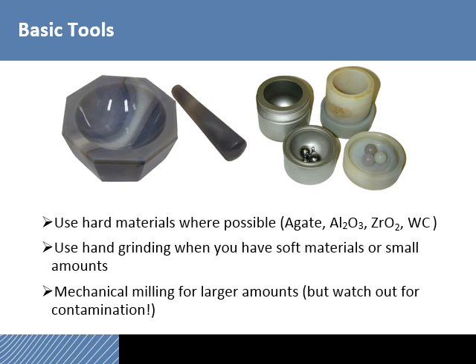Over here, shown on the right-hand side, are ball mills. This is what I use in my lab the most, as long as there's sufficient sample material. For the most part, I always use tungsten carbide. Why? Because it's the hardest of the things in that list, and so for the most part it will break up just about anything. The one thing I will have to warn you about, though, tungsten carbide tends to contaminate samples quite a bit. All of these have the potential to contaminate.